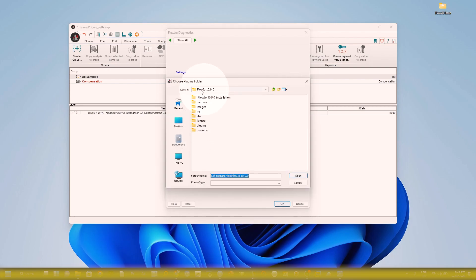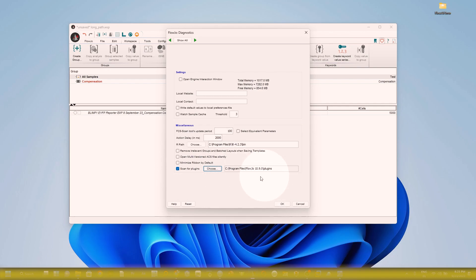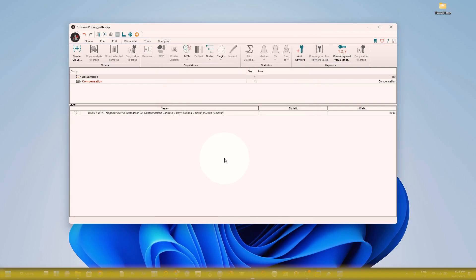You also need to assign the plugin folder. Click on 'Scan for Plugin' and assign the plugin folder in your FlowJo installation directory — you can see it in the C drive. I have already assigned both, so I won't do it again. But you must ensure both are assigned, and that R is installed on your PC or Mac.